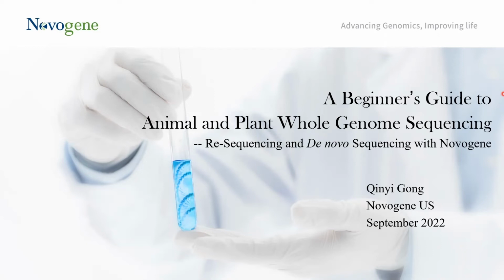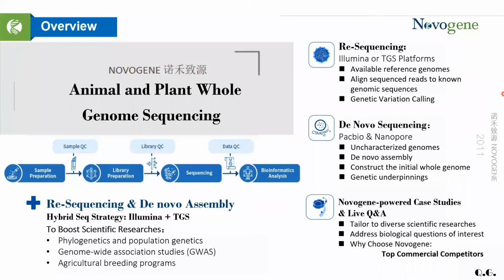Welcome to join us today to explore the world of animal and plant whole genome sequencing with Novogene, in which both resequencing and de novo sequencing are implicated. And this is an overview of the webinar content I'll be giving today.